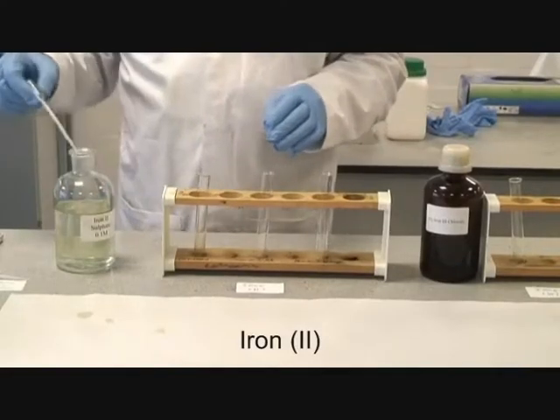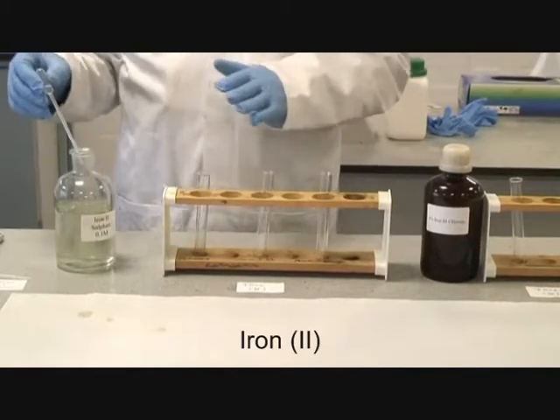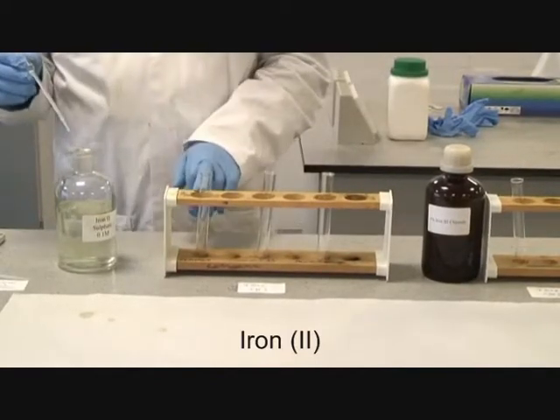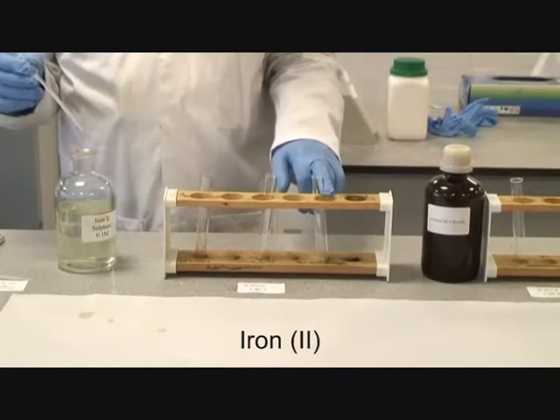The same procedure is now going to be repeated with iron 2. You must remember the order we did these things in: hydroxide, excess hydroxide, ammonia, excess ammonia, and then carbonate.